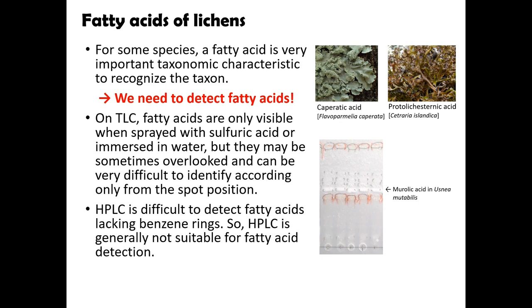However, on TLC, fatty acids are only visible when sprayed with sulfuric acid or immersed in water, but they may sometimes be overlooked and can be very difficult to identify only from the spot position. On the other hand, HPLC has difficulty detecting fatty acids, which lack benzene rings. So HPLC is generally not suitable for fatty acid detection.